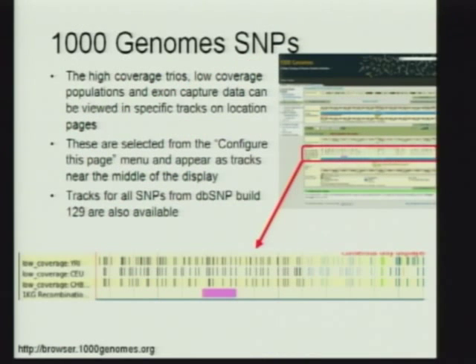To give a preview of the things Jan will talk about, we have things like tandem duplications and other structural variants. For more details on what these are, the 'Show Info' button always brings up a little additional information. There are also a few other supporting data sets like recombination hotspots and similar things that we incorporate in the 1,000 Genomes set of tracks.